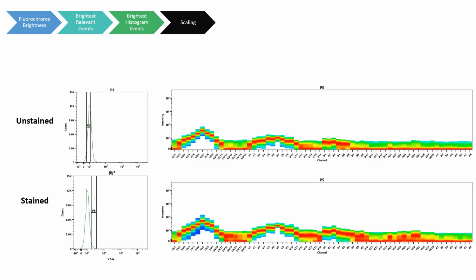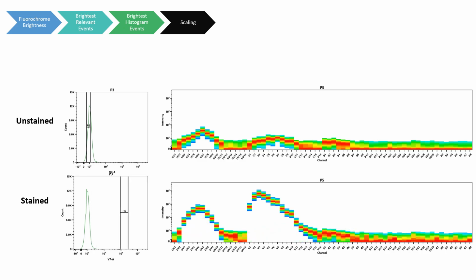In this next scenario, we have a reference stained with CellTrace Violet. When we look at the data, there doesn't appear to be a positive population. It might be tempting to just put the gate at the top part of the only peak visible, or even go away and come back with another one. Before you do, however, just remember that histograms are biased towards the majority of the events, and it may be harder to see the positive population if super rare. If we move the gate up to around 10 to the 5, you can see our positive population. Just explore the histograms first.